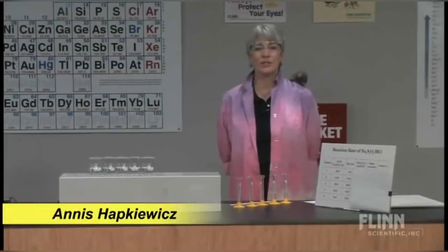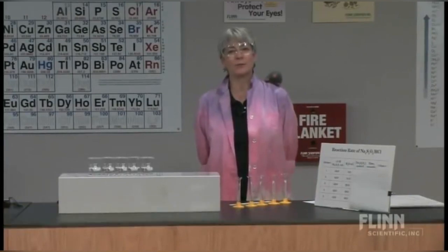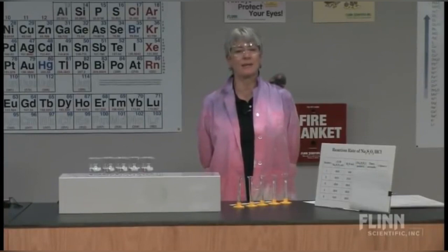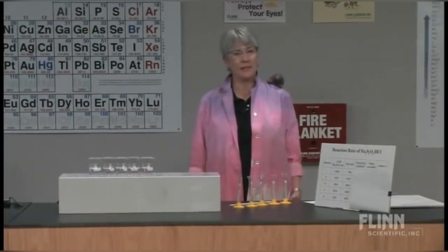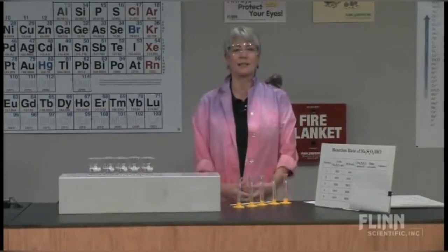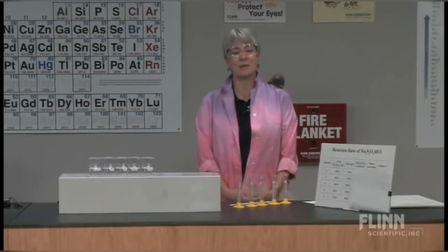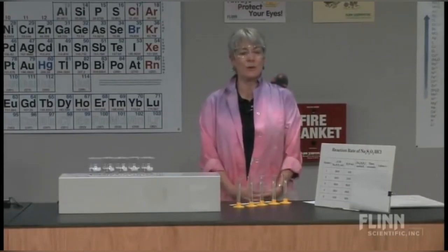This next demonstration I'm going to do is one that I've probably been doing for some 20 years. And the first time I saw it performed, I thought, boy, I hope I can do something like that. Because it was so interesting to see chemistry taught with a demonstration and the talking. And Dave Tanis was my inspiration. When I saw him do it, I decided I needed to go to more workshops. But this is a kinetics demonstration that I've since used mostly as a lab.